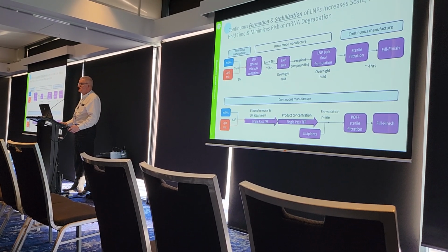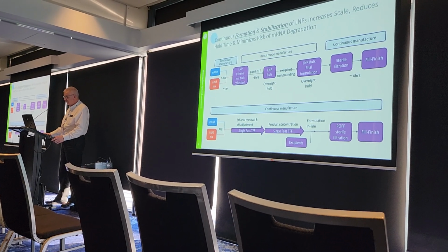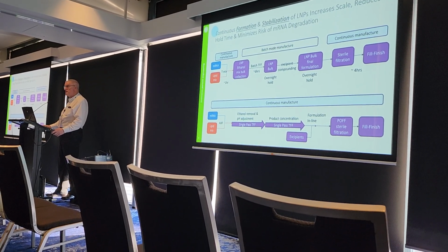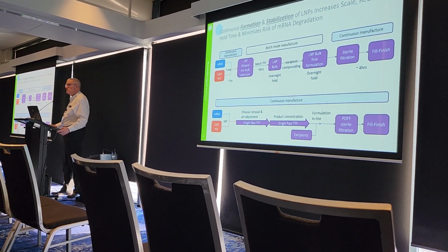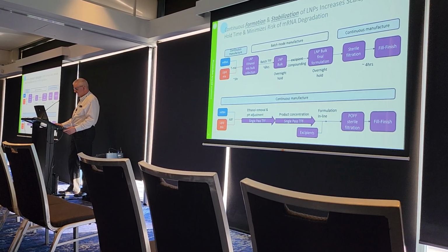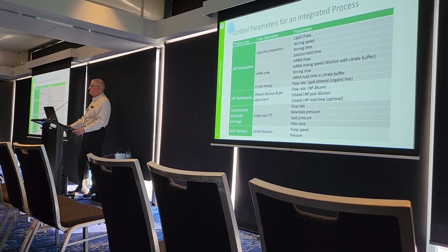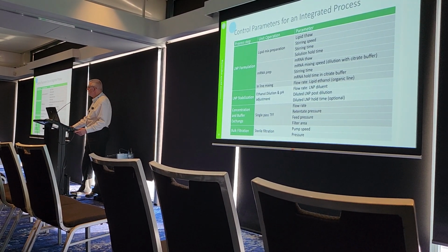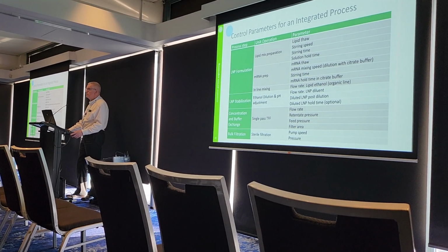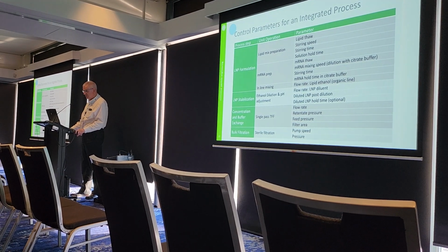TFF to get you the buffer exchange and the reconcentration. If we can crack that, then we've got a truly continuous single-pass process. But of course, in doing it, you've got to be able to understand the way you control your process. You've got to be able to understand what is important when you are controlling that process.